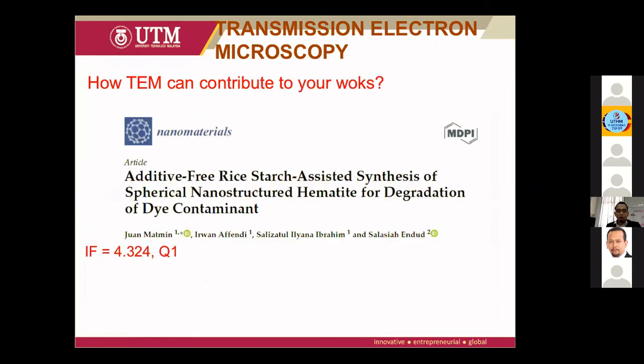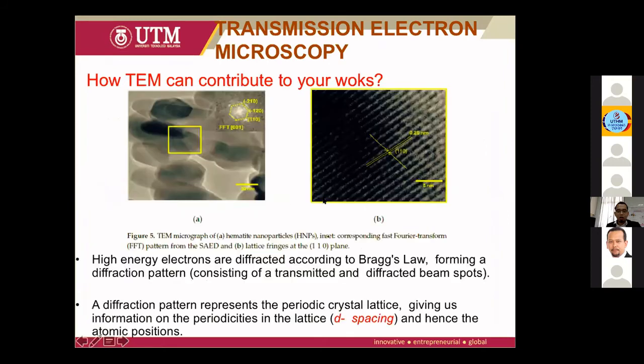Okay, how can TEM contribute to your work? In this paper, I discuss rice starch as an additive-free route, but I need to prove this sample is actually a spherical nanostructured hematite. So when we do our TEM analysis, we found that this structure consists of, this is what I touched on, the FFT.